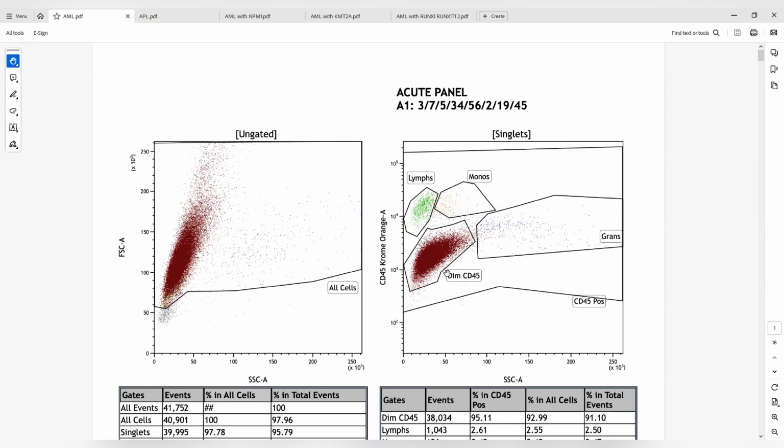So since I'm talking about acute myeloid leukemia, I'm going to say that generally speaking, there are immature hematopoietic markers, and these are dim CD45 expression and CD34 expression. These would not tell you whether these are myeloblasts or lymphoblasts, but these are markers that would tell you that these are immature hematopoietic cells. However, be careful, not all blasts are CD34 positive.